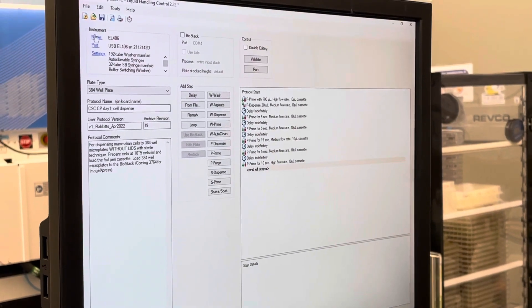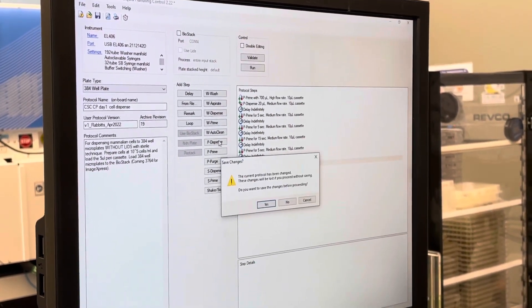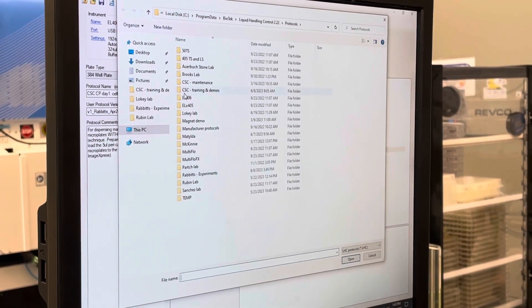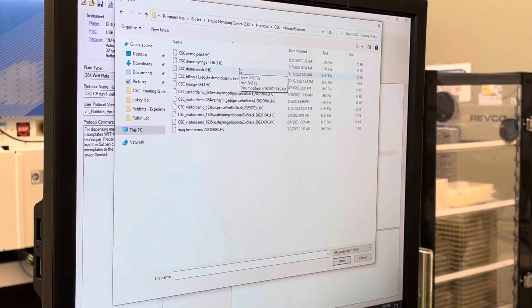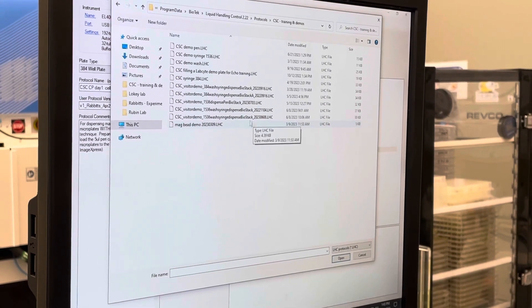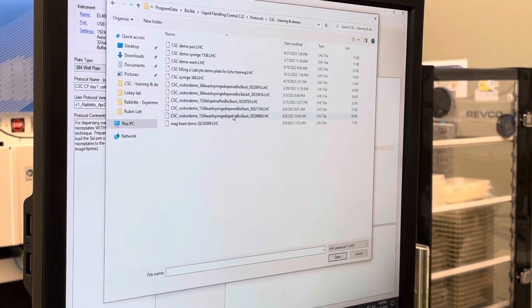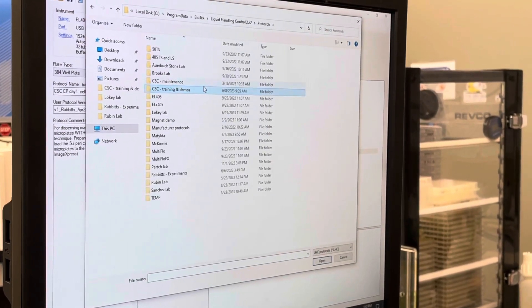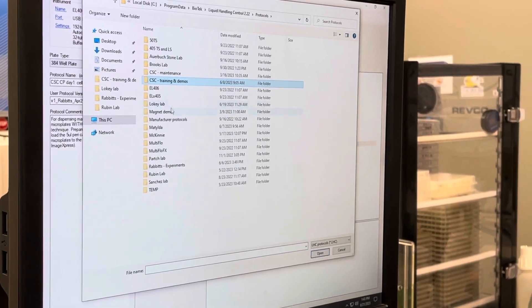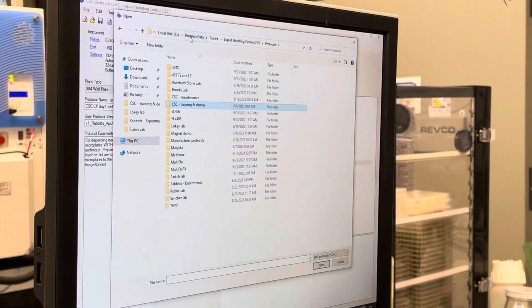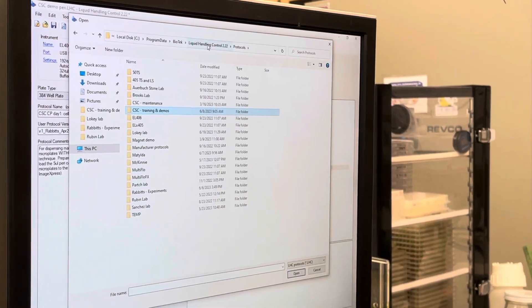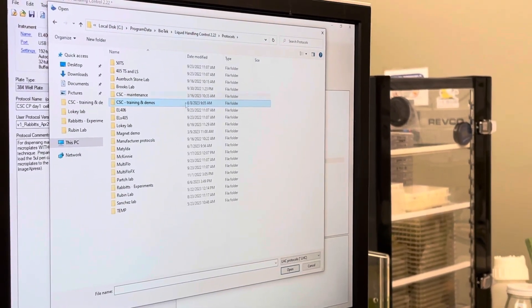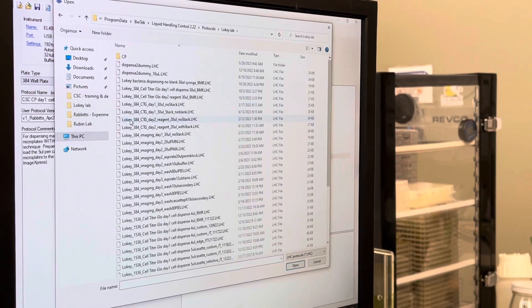While you're in this window, you can open any protocol that you want. I'm going to use one from the Lowkey lab. The files are all saved in the C drive, Program Data, Biotek, Liquid Handling Control Protocols. So if this ever goes to a different place, that's where you know to go. Each lab has their own folder.